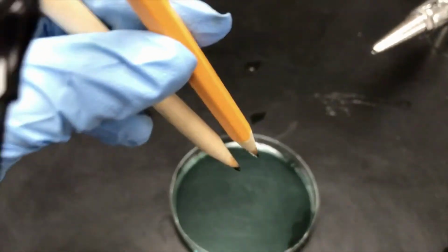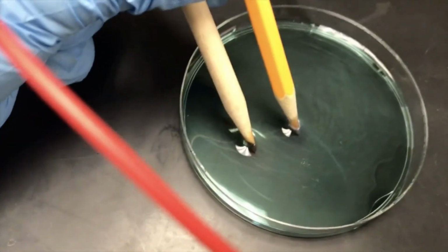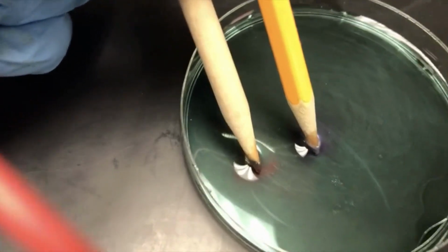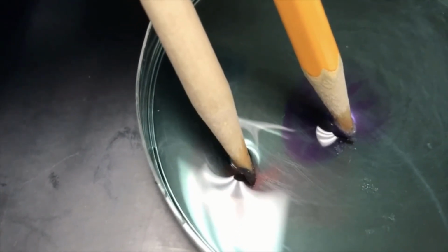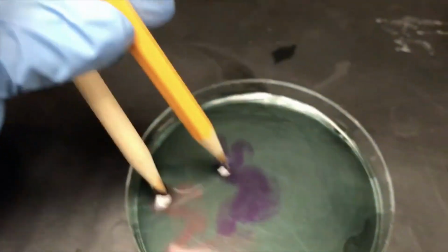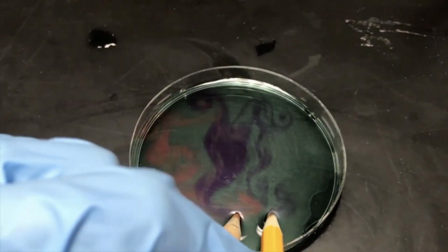So now if I take the two electrodes, make sure they're not touching, and allow them to touch the solution, what you can see happening is, look at that purple one, you've got bubbles forming on that one, okay, and it's turning purple. For the other one, bubbles are forming as well, but now it's turning pink. So you can even make some cool designs with it. Pretty cool, huh?